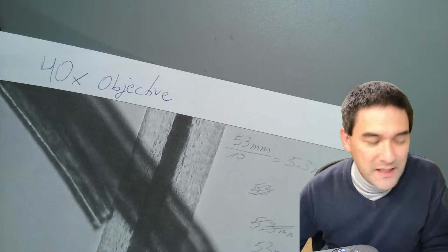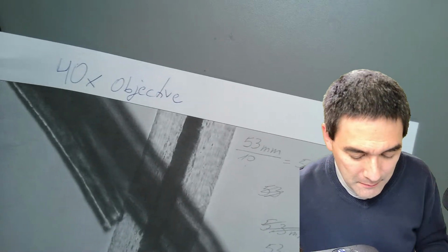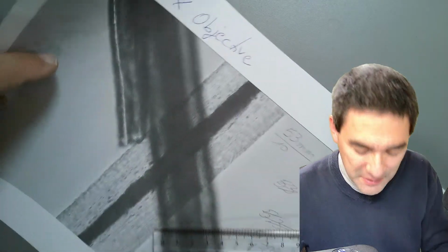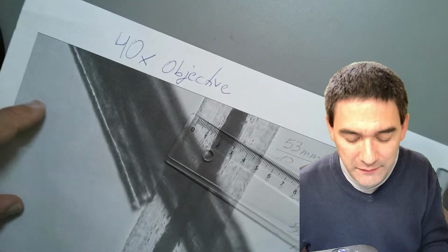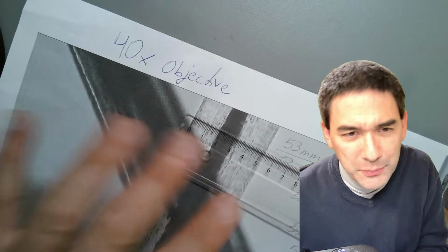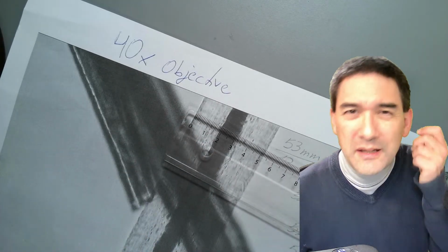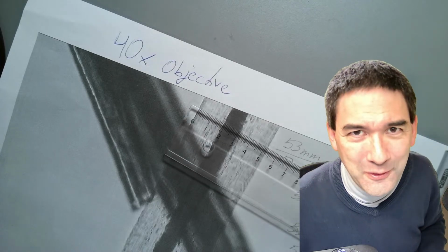Another thing that I just want to say is the following. You see, concerning the precision, the hair is also different. Some is thicker, some is thinner, right? So even if we now have a very precise measurement on the thickness of the hair, maybe the next hair that I'm going to look at is again going to be different, right?